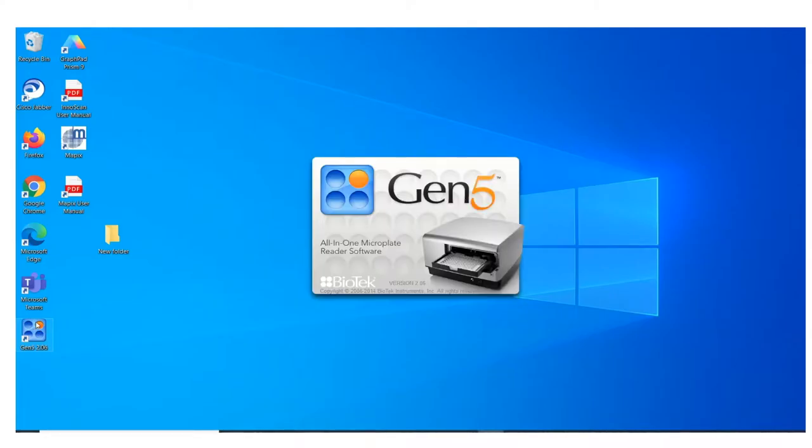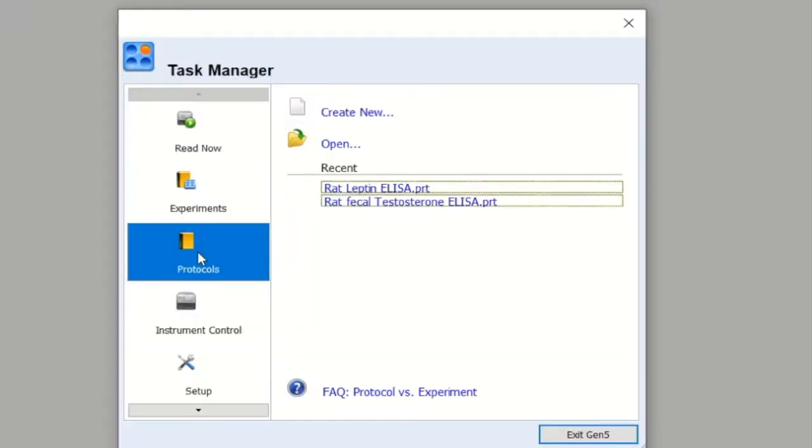Here's the run-through of how to use the Gen5 software. On the desktop, just click on Gen5 2.06. What you want to do is set up a protocol, so go ahead and create a protocol.